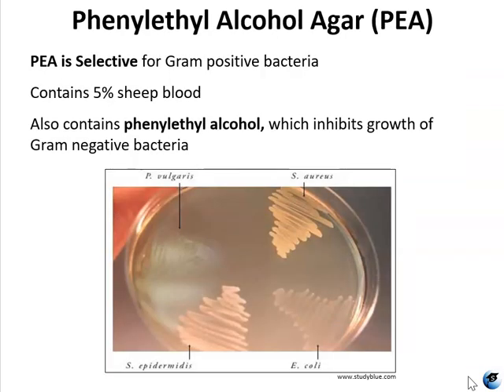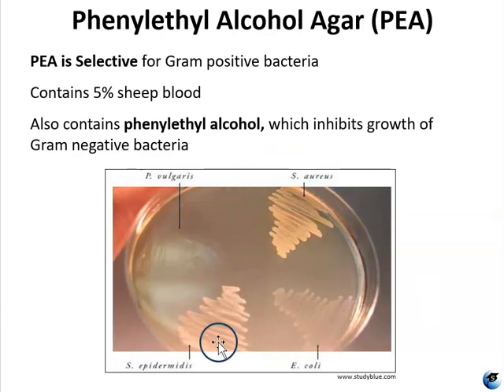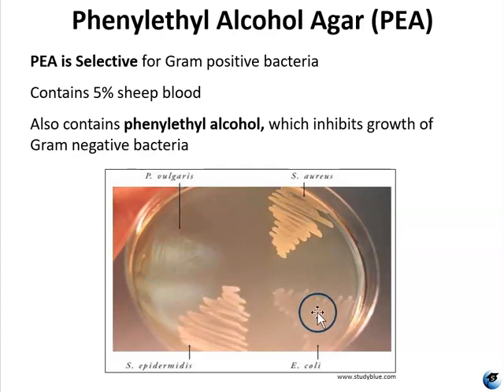PEA, phenylethyl alcohol agar, is a selective media that encourages the growth of gram-positive organisms and inhibits the growth of most gram-negative organisms. Some yeast will also grow well on PEA because they are gram-positive as well. PEA is not a differential medium because it does not distinguish between different organisms — it merely encourages or discourages growth. Phenylethyl alcohol is the selective agent that inhibits gram-negative organisms by breaking down their membrane permeability barrier and by inhibiting their DNA synthesis. When interpreting a PEA plate, you first want to look to see if there is good growth, and sometimes you may need to compare it to growth on general growth media.